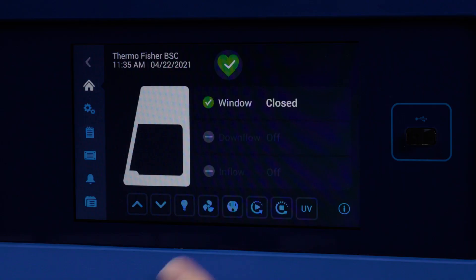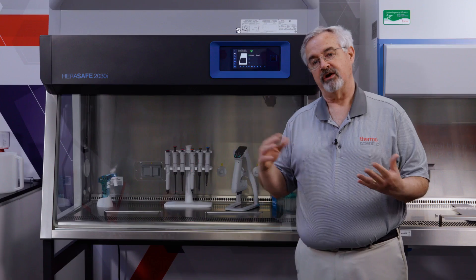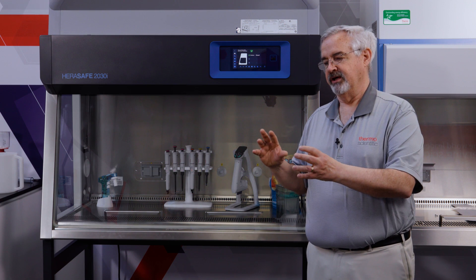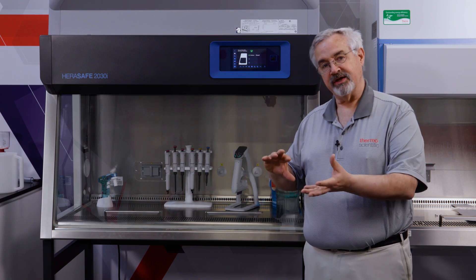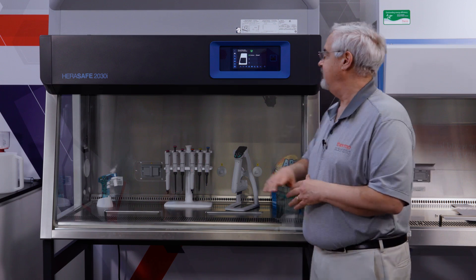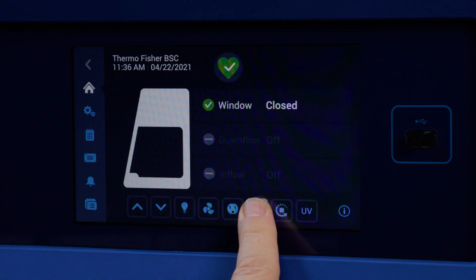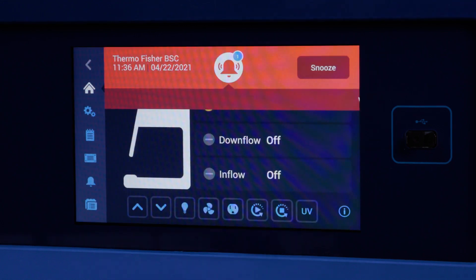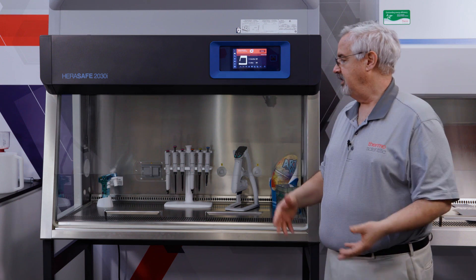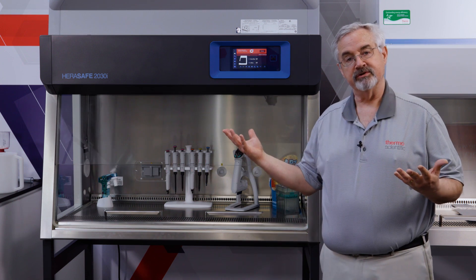In this particular cabinet we have Auto Start and Auto Stop. They're configurable, so if one particular user wants to have some things come on and some things not, they can have it set their way, and another cabinet can be set another way. I'm going to press and hold the Auto Start button, and as the cabinet responds, we see the window open.